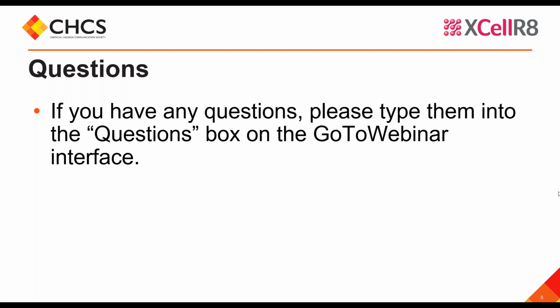Okay, a question on eye corrosivity and irritation now. Does eye corrosivity and irritation testing have a similar IATA which can be followed? It does, yes. There is an IATA on eye irritation and corrosivity, looking at the different in vitro methods and in vivo methods for that. So I think if you just search online, you should be able to find it quite easily, but if you can't, by all means, follow up with us later.